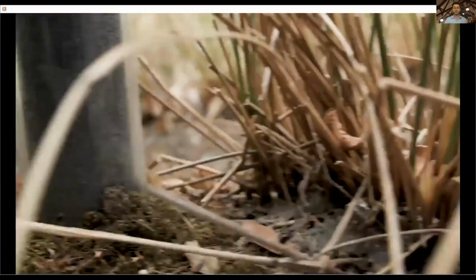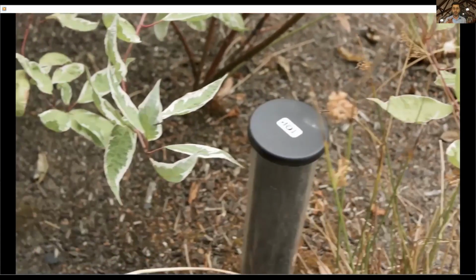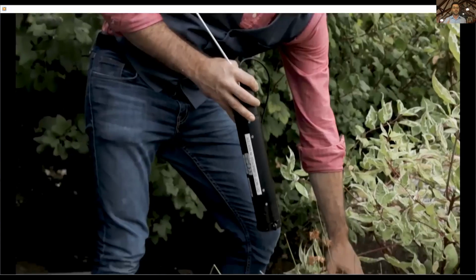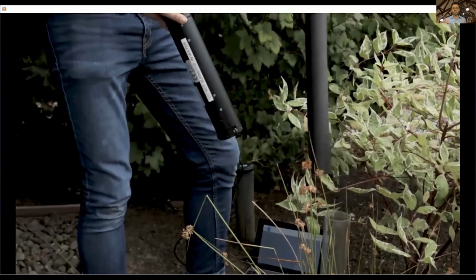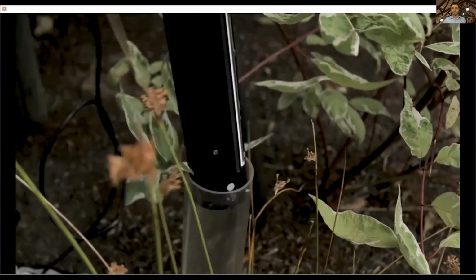These are some tubes we have actually installed in our own area. We do put a foam core in to keep the UV light out, but as you've seen, duct tape, PVC pipe, there's a lot of different methods to make sure that roots are growing in that area.